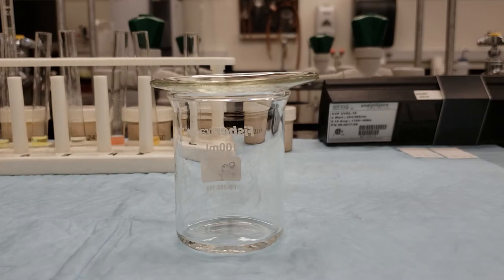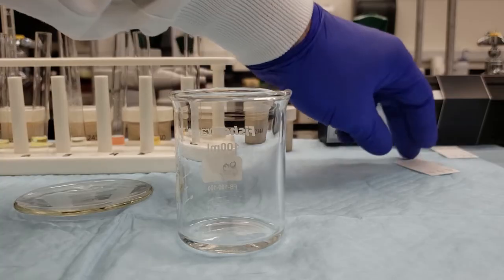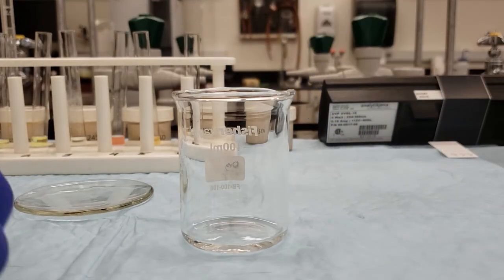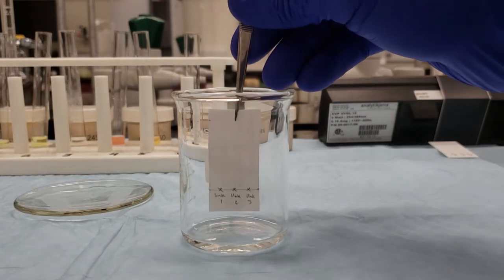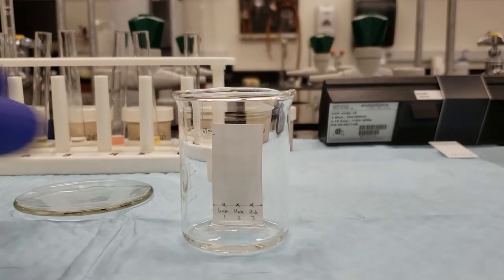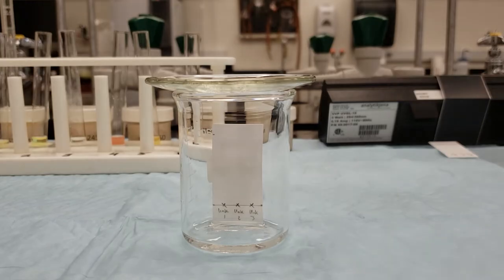All right, we're ready to develop our first plate of unknowns. We'll go ahead and place them in the developing chamber just as we did our known components. Set them down as straight as possible, put our watch glass on top, and wait for our solvent line to make its way to the top.